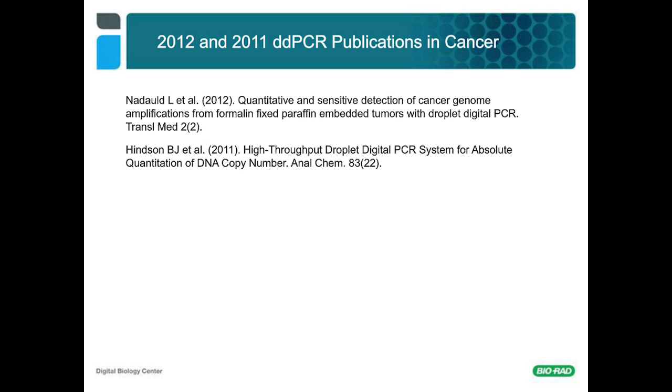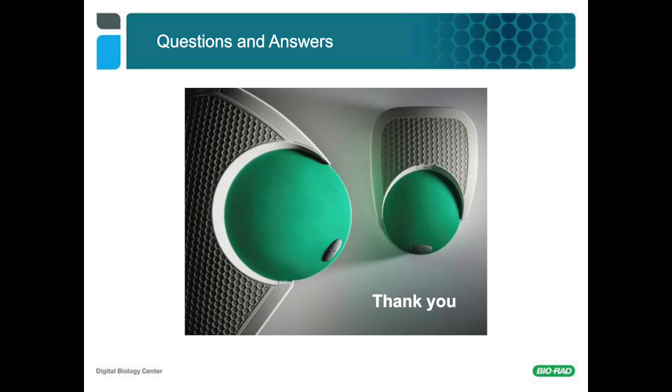The care that needs to be taken when using different sample prep methods is actually the more important factor. So things like organics, phenol chloroform, and excess amounts of ethanol, for instance, left over from any of the sample prep methods. If those kinds of organics get into your digital PCR, you can have disruption of your droplets. Obviously, this oil and water emulsion system doesn't like the addition of organics like phenol and chloroform. As long as they're cleaned out properly, then it's fine.